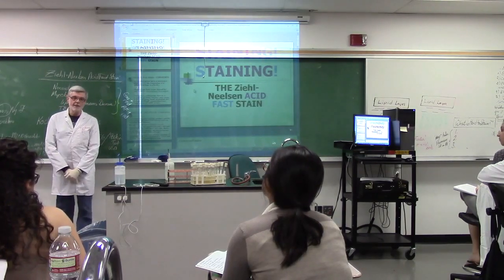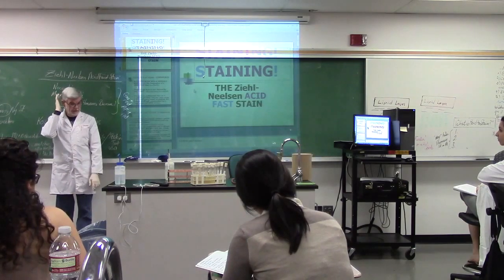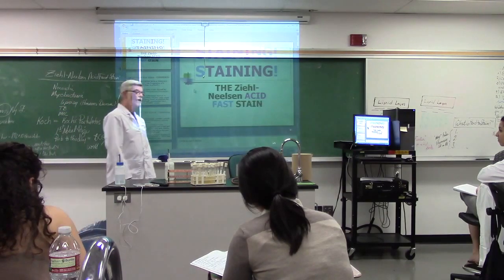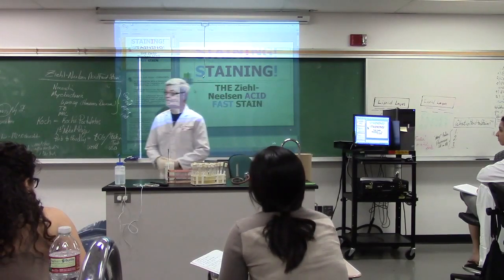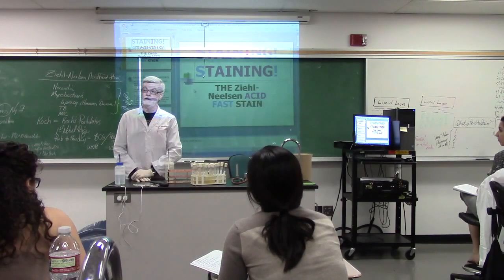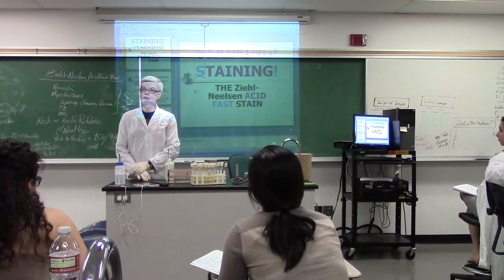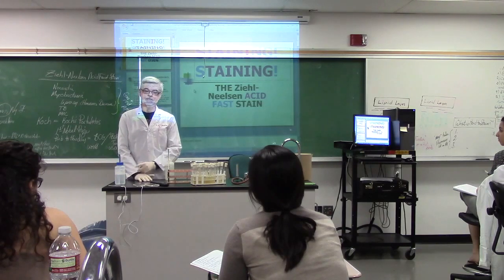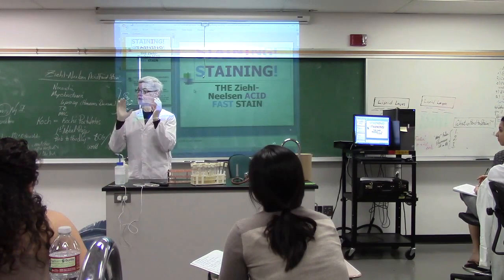After we take the lab practical 1, the class after that, bring in what you have done, and you better have done something, on the procedure cards. Now I don't want them in final finished form unless you're confident of them. If there's some that you're very confident, like IMViC. All IMViC is a chart. And the purpose is to determine if the gram-negative rod you see under the microscope is E. coli, which is an indicator of pollution, or something that looks like E. coli. And then you put a little chart.